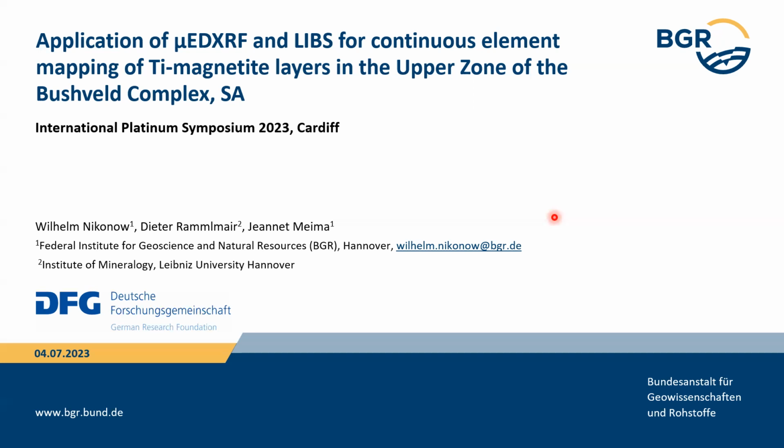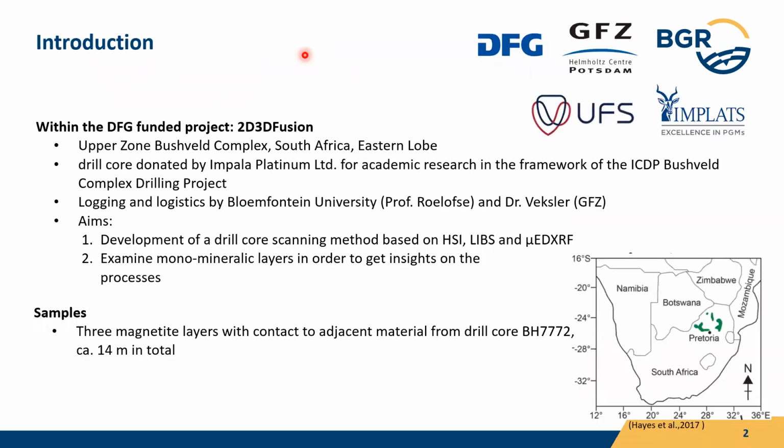Thank you. Yes, thank you and good afternoon. I think we have a nice continuation of the talk we just had before, but now just with a bit more focus on the analytics. I will talk about micro energy dispersive X-ray fluorescence and laser-induced breakdown spectroscopy applied to the titanium magnetites of the upper zone of the Bushveld Complex.